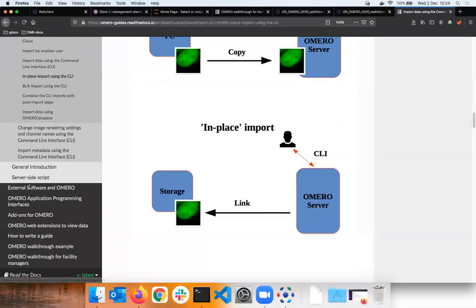There's another tool that, sorry? On your website, you don't have this type of tools available as a plugin or something like this? Not well, and at some level we have actually the script which I used to import all the data you are now using.